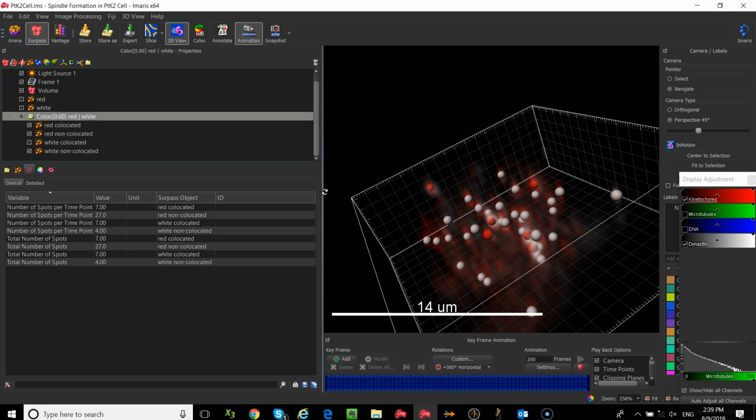Okay? Now, I'm almost out of time, and I didn't get to cover tracking. So here's what we're going to do. As I mentioned, I'm recording these sessions. So the next session, I will cover tracking, and I'll make sure that they get shared with you so you can get to see that. I'm probably going to have to switch it around a little bit and do tracking before colloc for the next session, so that we'll have one that does colloc at the end and one that does tracking.